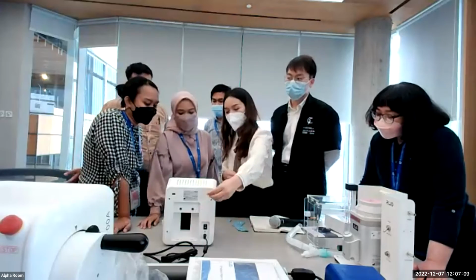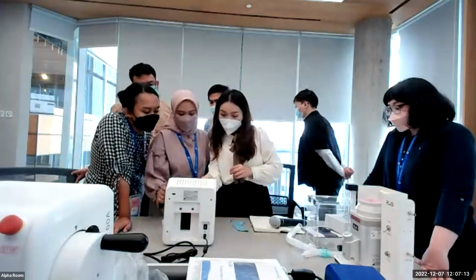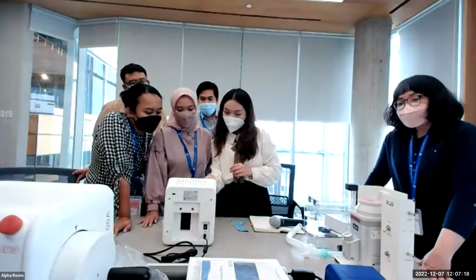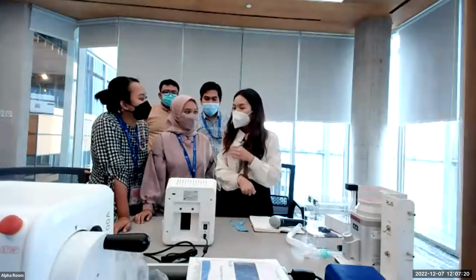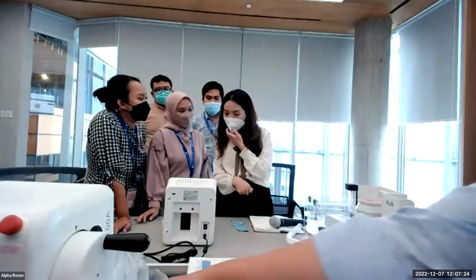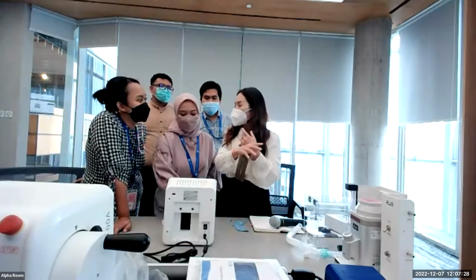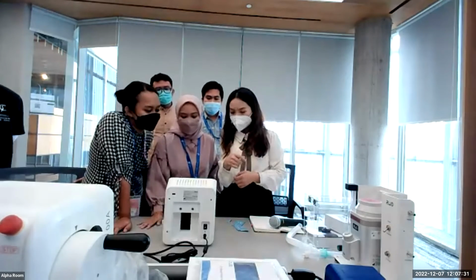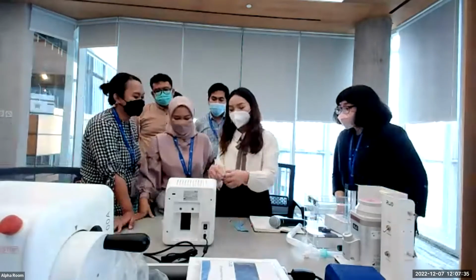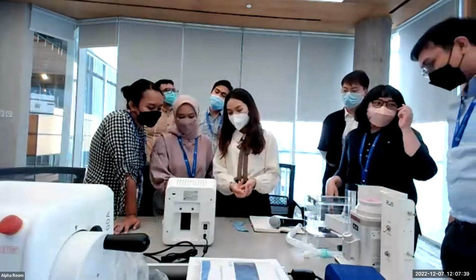If you connect the USB here, then you will see the previous counts. This export. The format of the data is Excel, Word, PDF. You can choose. Yeah, because there's no USB, so we can't see the forms. But you can choose many forms.